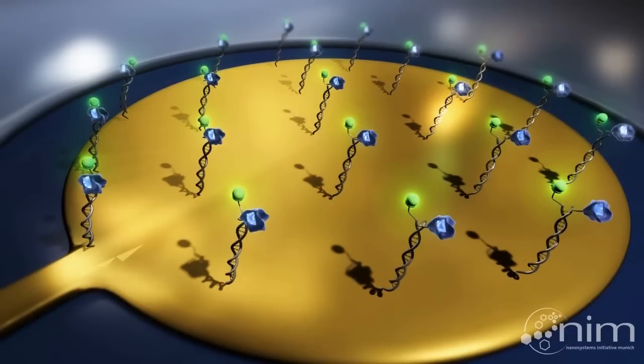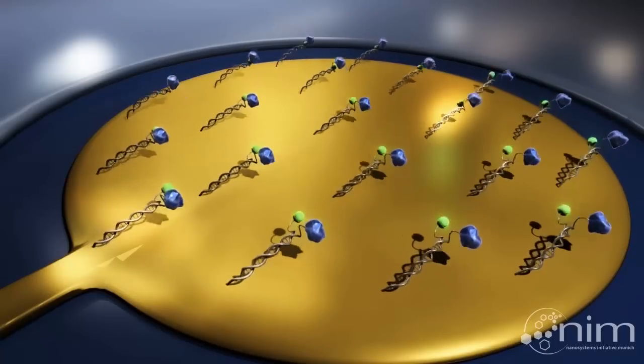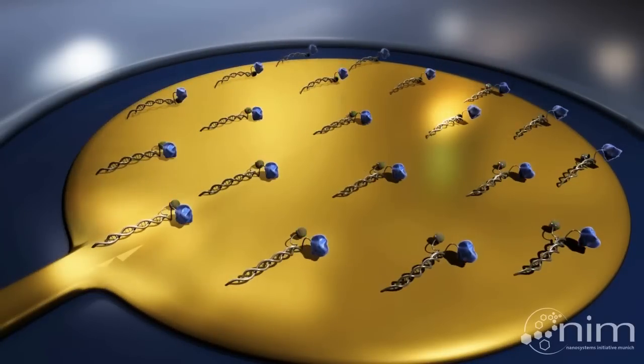One strand of each DNA molecule is modified with a green fluorescent marker. Whenever the DNA approaches the surface, the light emission is quenched by the gold electrode.